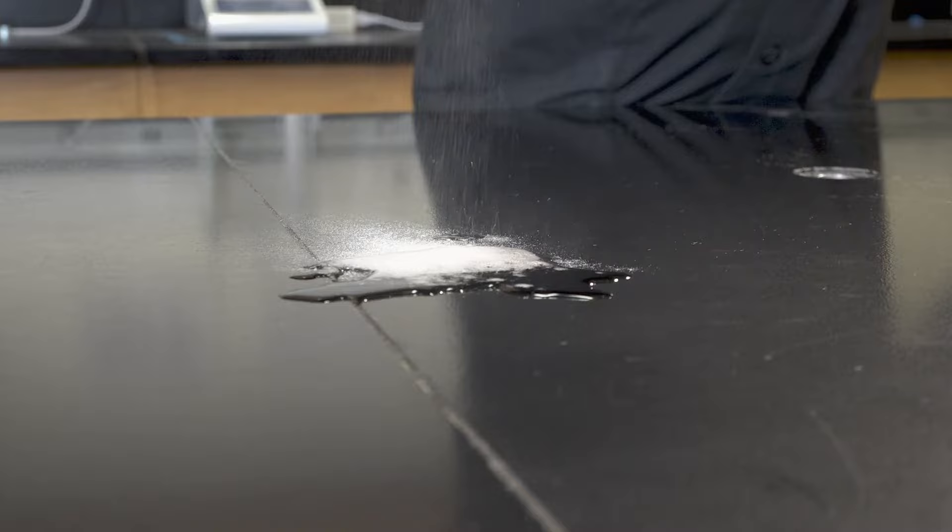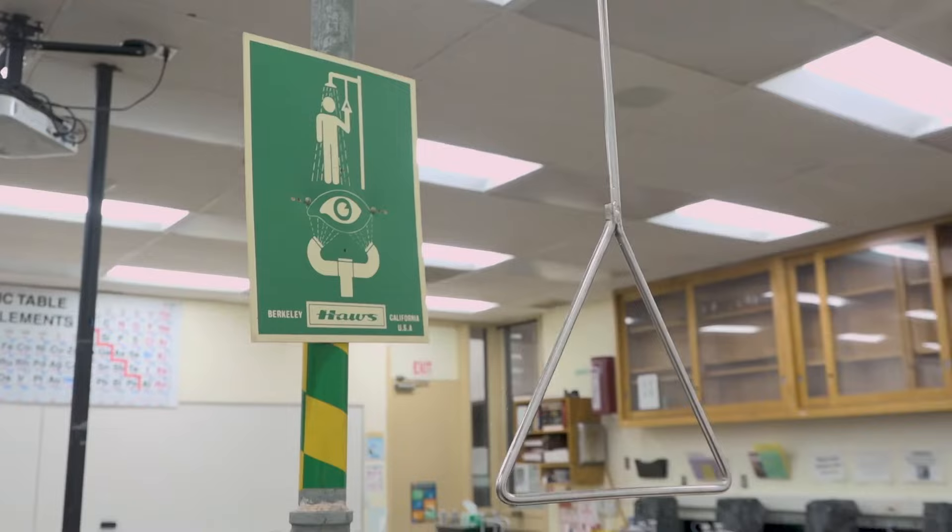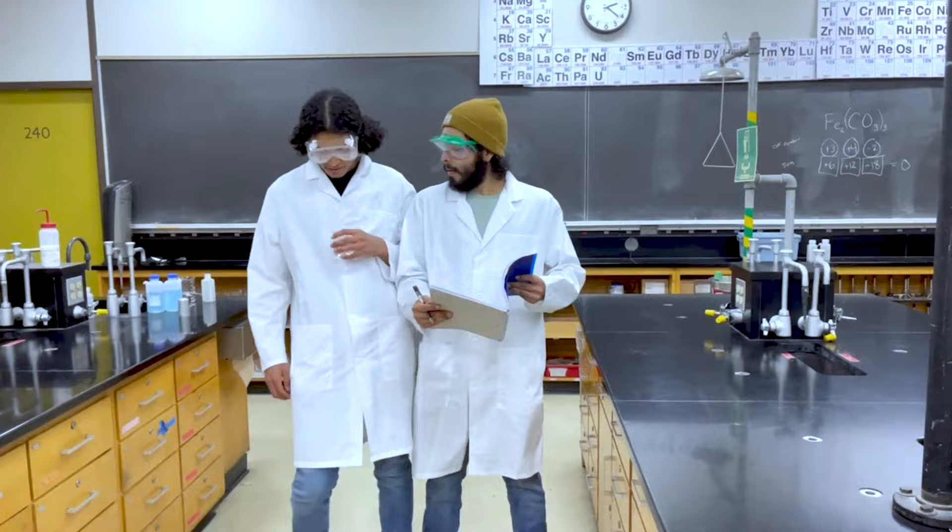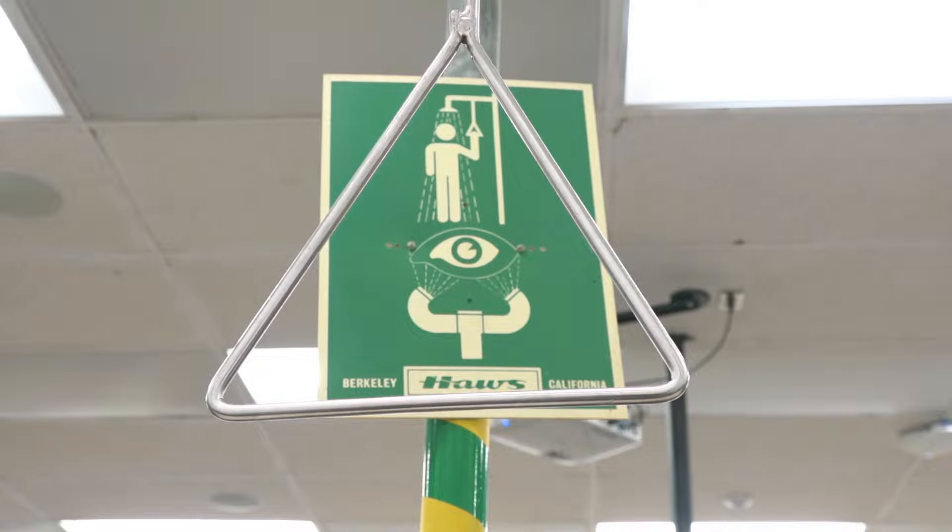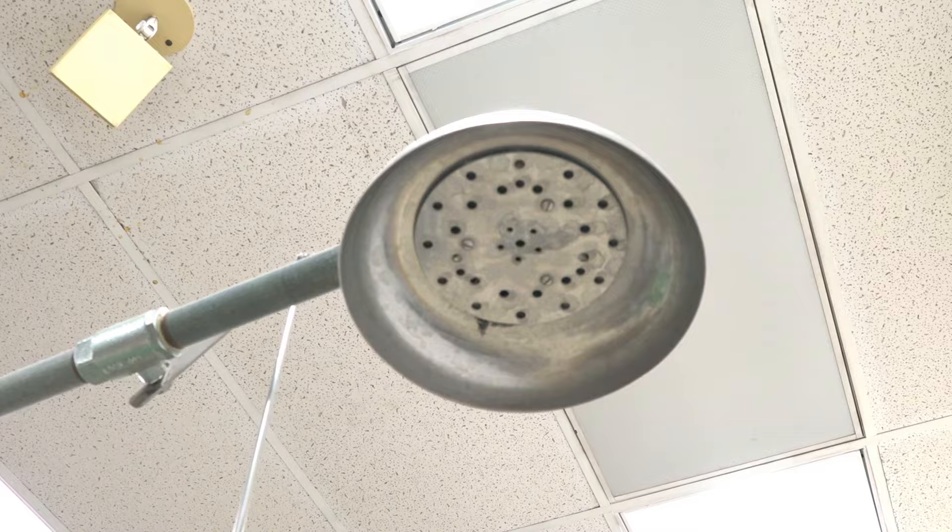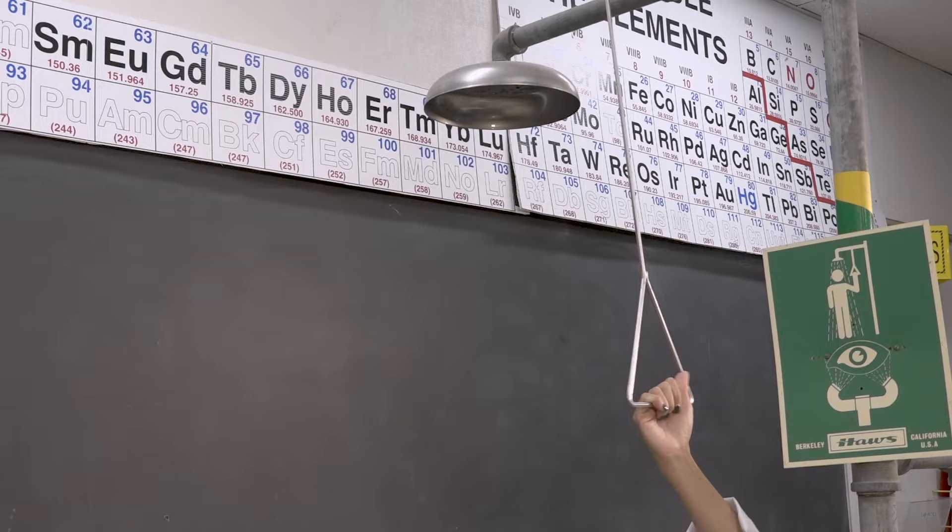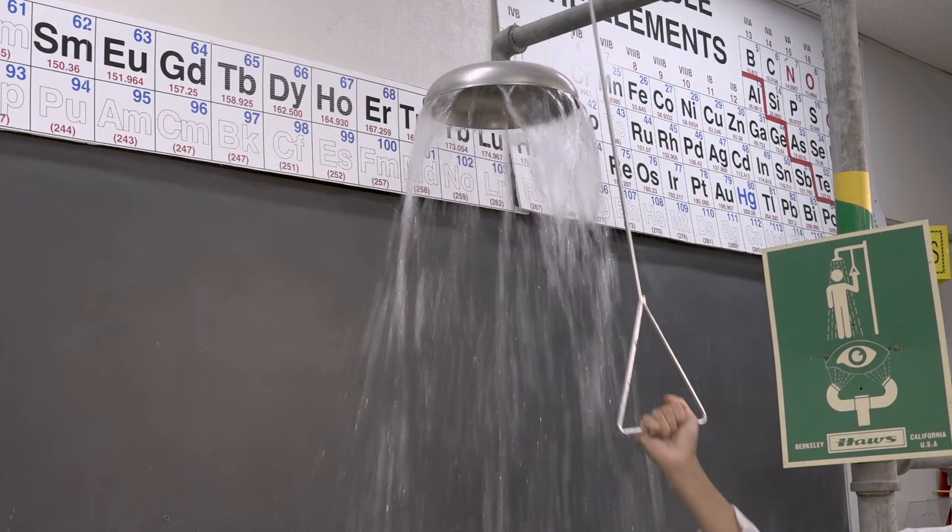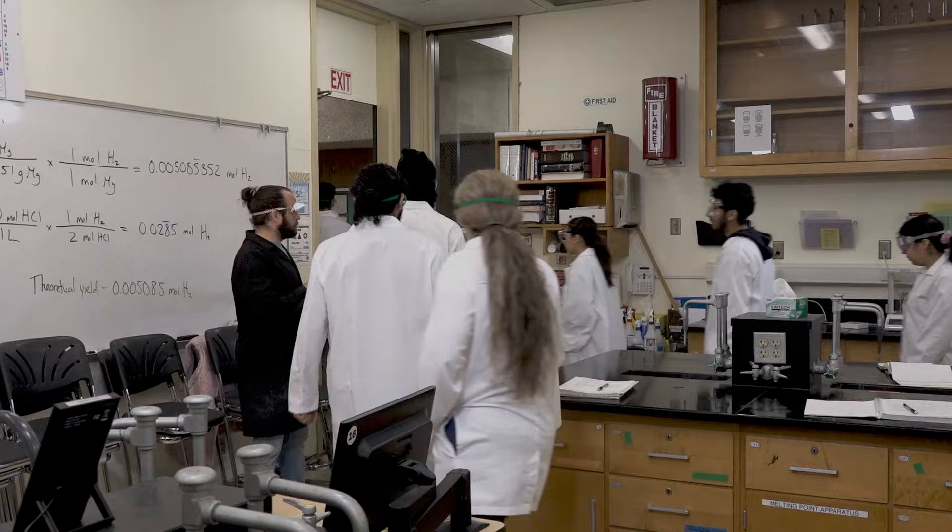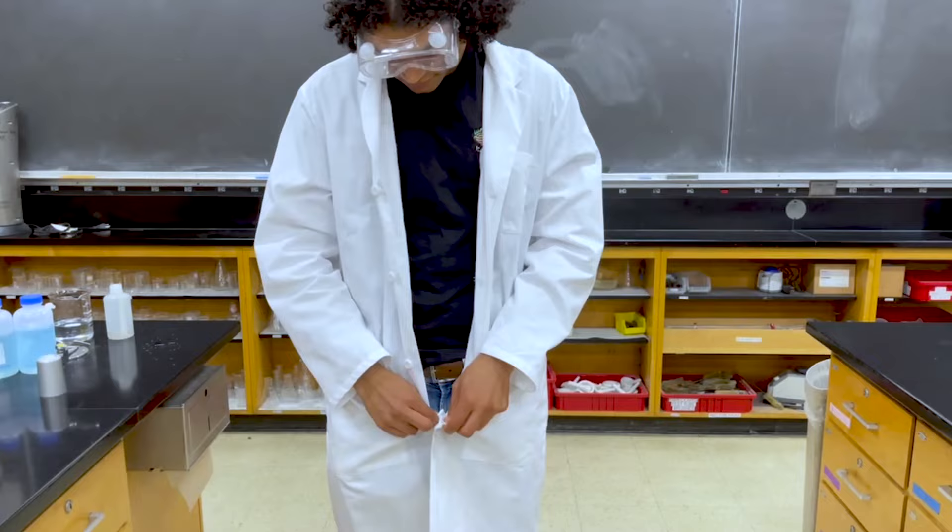Spills on the benchtop or floor need to be neutralized with special chemicals before cleaning. For more severe spills, it may be necessary to wash off contaminants in the safety shower. This may seem extreme, but if a dangerous chemical seeps into your clothing, you cannot allow it to stand in contact with your skin or you'll risk injury. Such spills must be thoroughly rinsed immediately, which is what the shower accomplishes. It puts out a large amount of water, allowing your skin and your clothing to be cleared of all chemicals. Pull the handle and make sure all affected areas are thoroughly rinsed. Remove all affected clothing. Your instructor will clear the classroom. Again, this sounds extreme, but modesty is not as important as safety.